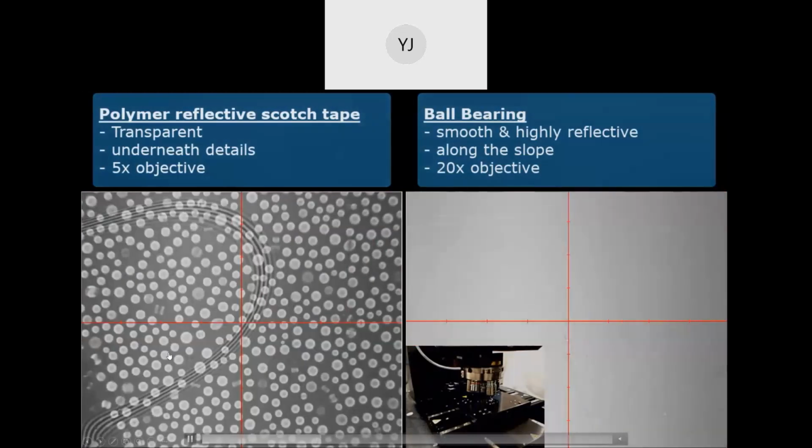And you can also see these very nice fringes. These are quite challenging to achieve, right? So maybe I pause a bit here. So you find the surfaces. Like we talked about, the scotch tape is on top, which is what we want to measure. On the bottom, what you see, the circles or the patterns, is not on the tape. This is actually below the surface, right?